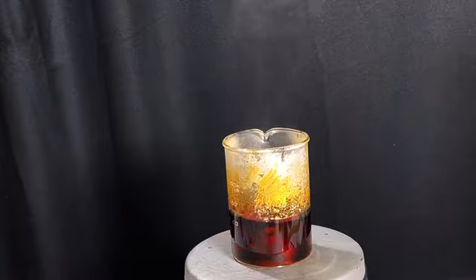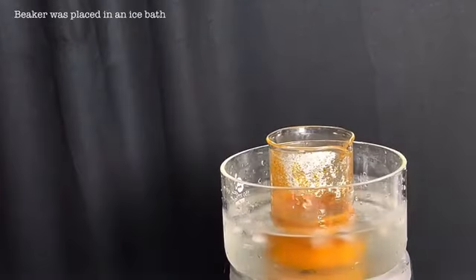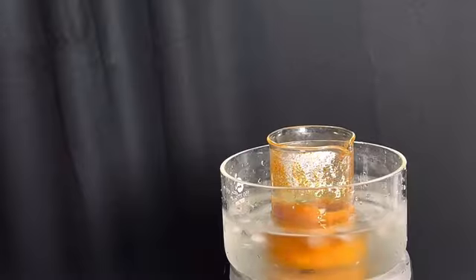The contents of the beaker were then allowed to come to room temperature. The beaker was then placed in an ice bath. This will cause the benzotriazole to separate as a viscous oily liquid at the bottom of the beaker. The contents were then thoroughly mixed.